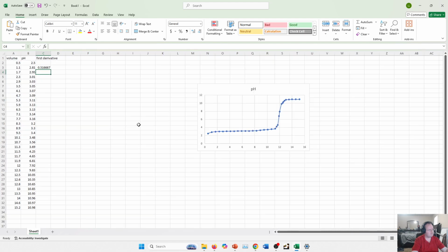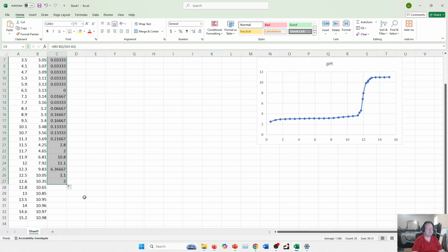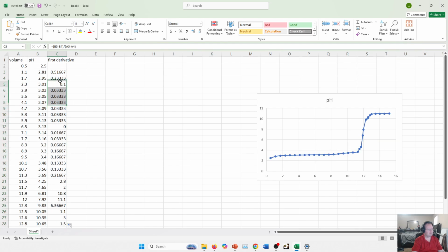I'm going to scroll out some. Now, by itself, that one data point isn't all that helpful. But if I go here, and you'll notice how my cursor changes from an open cross to this closed one. If I click on this little dot here and I hold down and scroll down, it copies the equation for me, and then it does it for me. And when it does this, it increments it. So each time it's adding, if you notice, if I click on these, if you look at this little window I'm highlighting now, sorry to make that. Whichever one I do, you'll notice it's changed the values. And so as I scroll down, it changes it by adding one to each.